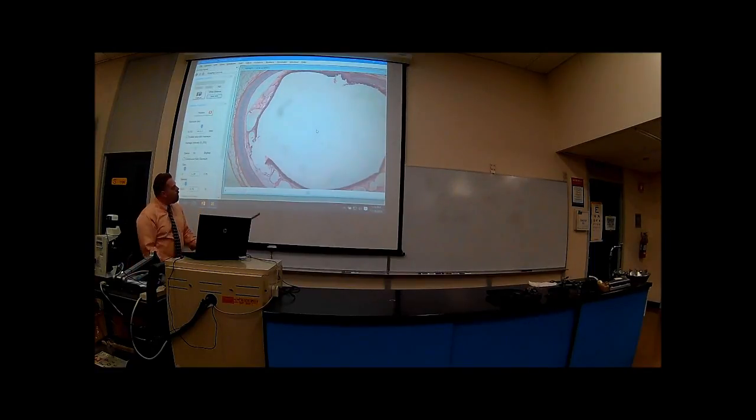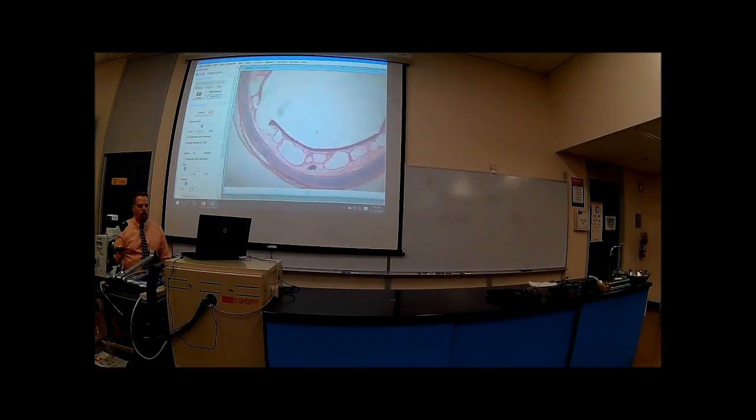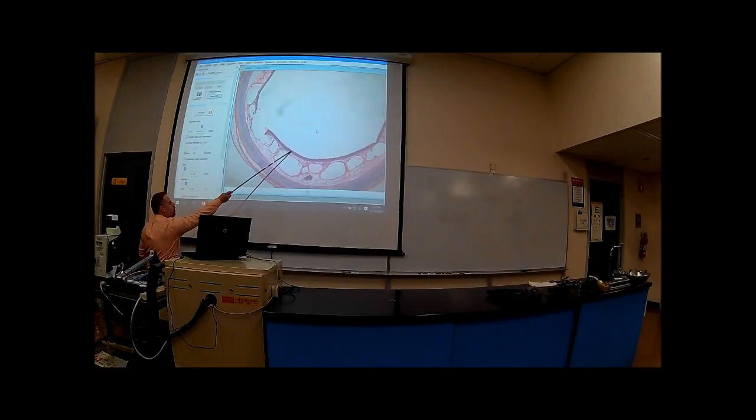Okay? Then we go out further, and you're going to see some connective tissue out here. Eventually, you'll see some muscular tissue, which I don't think is on the slide. But that's what we have here. Some kind of structure that has a lumen. So we're in some kind of tubular structure. You can take a quick glance at that at 40x at low magnification. But let's just get close up to the epithelial layer, the lining of this lumen, which is this area here. So let's get up closer.